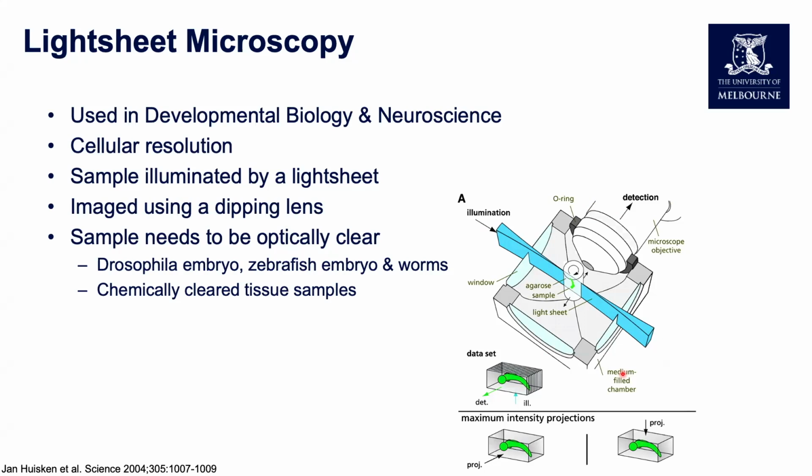It is a little limited in resolution in that it will only give you cellular resolution. Again, there are lots of different flavors of light sheet microscopy. Here we're focusing primarily on large sample light sheet microscopy. As the name suggests, the sample is illuminated by a light sheet.